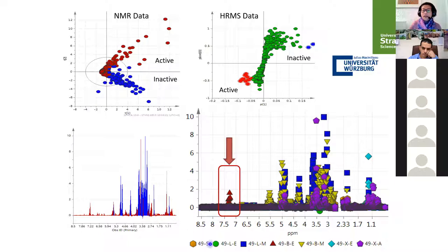Now, regarding what is the best media, we could also see that from the NMR. So here, for example, we see all these triangles in the aromatic region that represents the bioactive metabolites. And these actually correlate with the alginate beads in ethyl acetate, so as you would see here, okay? So which means that in that way, we could make a decision that our scale up should involve the alginate beads as our chosen media.